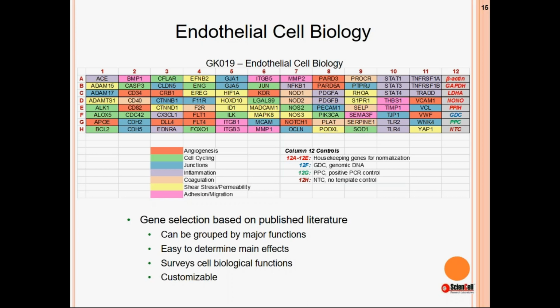But moving forward, let's say you now have your qPCR array with optimized primers. What can you do with it? Well, one of the most common applications of qPCR in basic science research is probably comparing relative gene expression between two cell populations. For example, you could take two identical plates of endothelial cells cultured in basal, serum-free endothelial cell medium and add VEGF-A, an angiogenic growth factor, to one of them. Performing qPCR on cells with and without VEGF would then reveal VEGF-induced changes in gene expression.